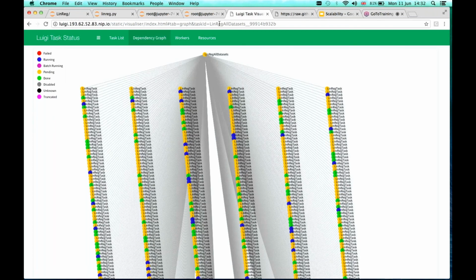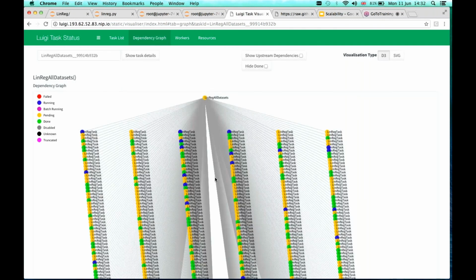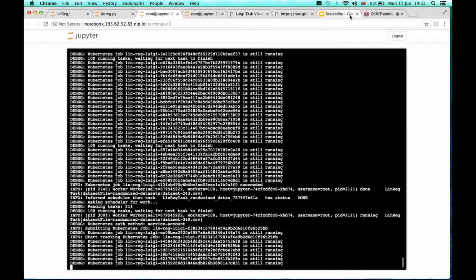Okay, so we just refresh the page. You can see all is running. And as you can see here, it's all still running. And okay, in the meanwhile, let me go back to the slides.